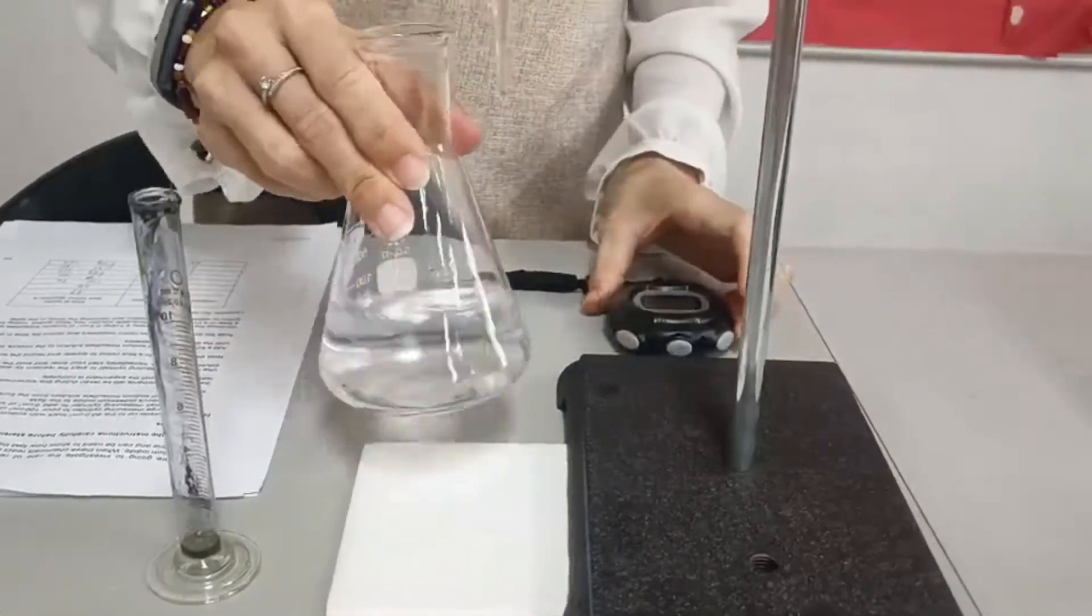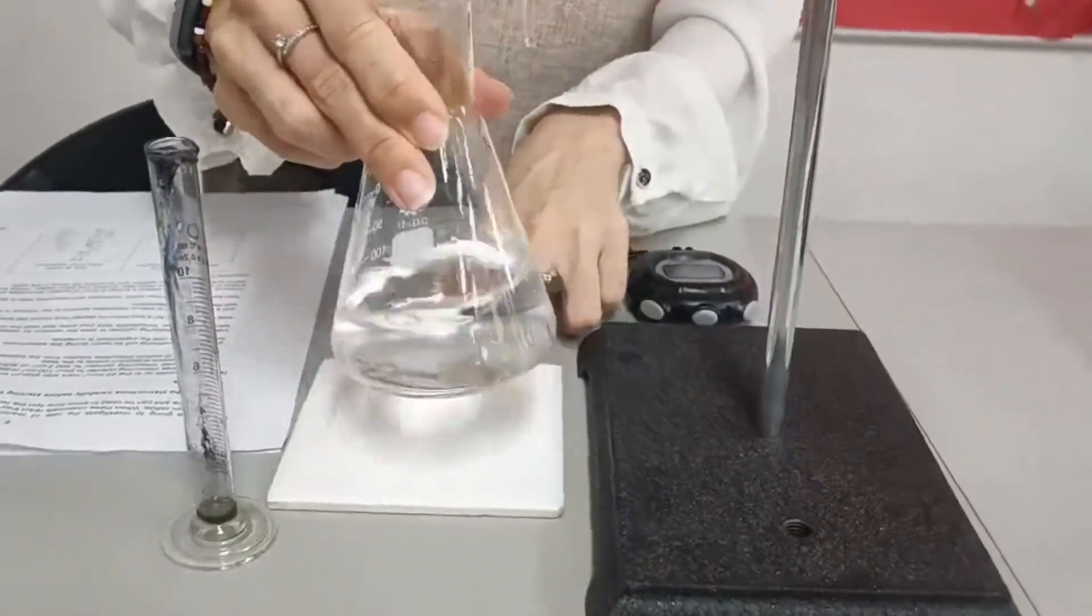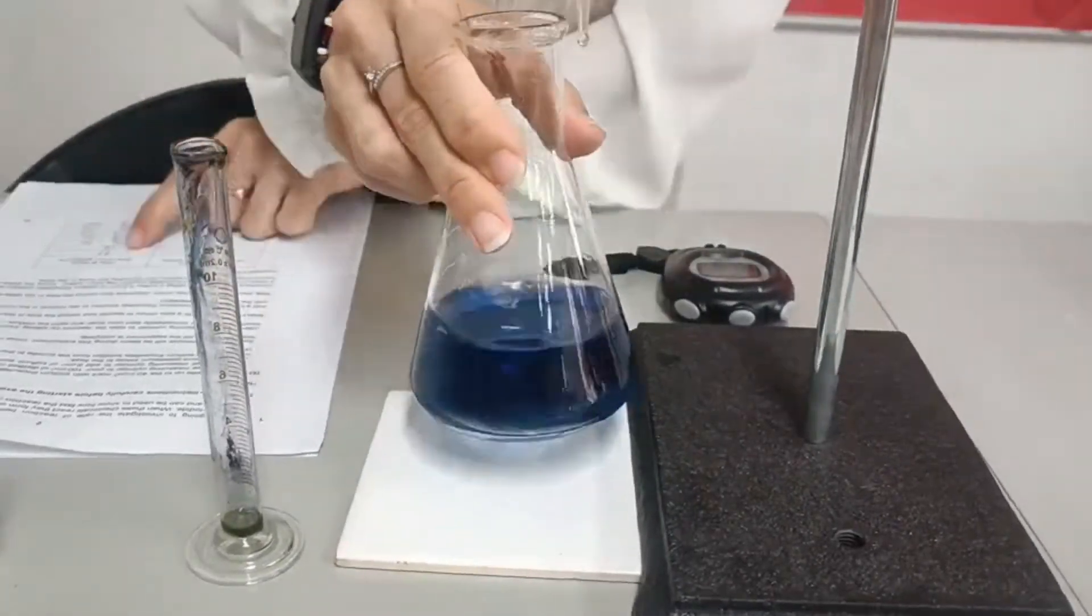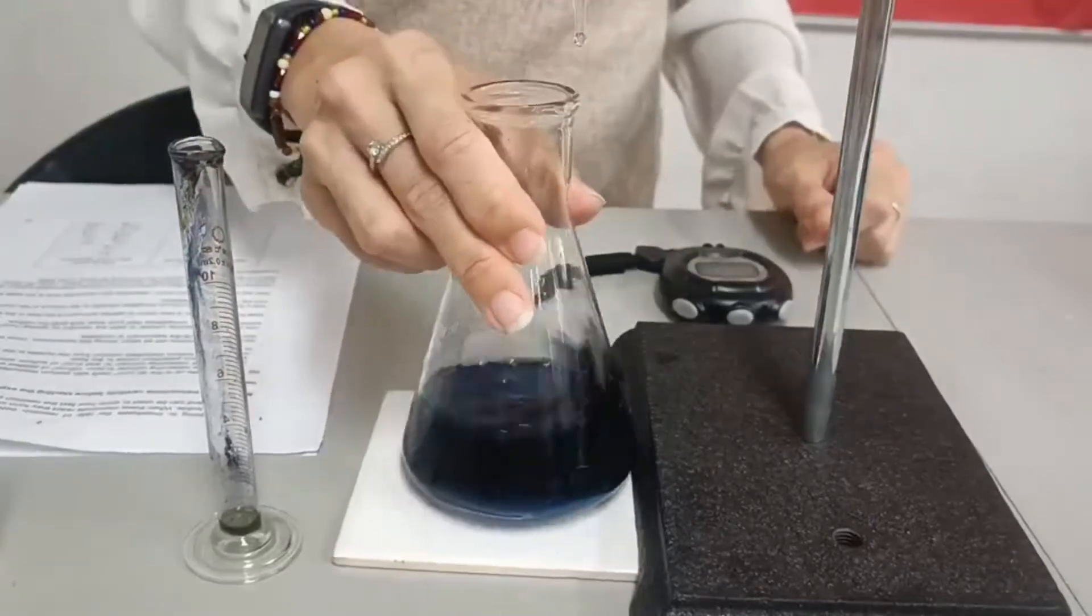The moment it turns blue color, you have to stick down the reading and record the time in your column. That's your first.